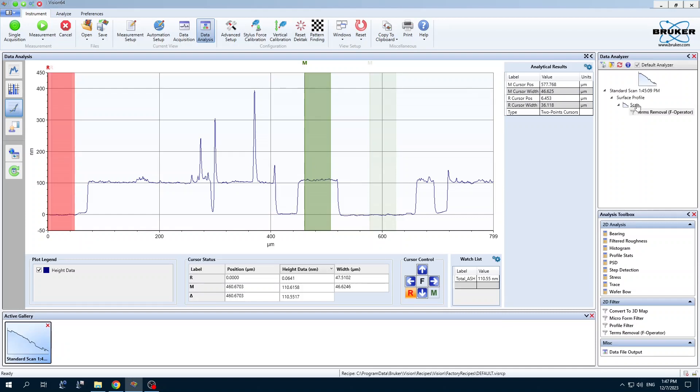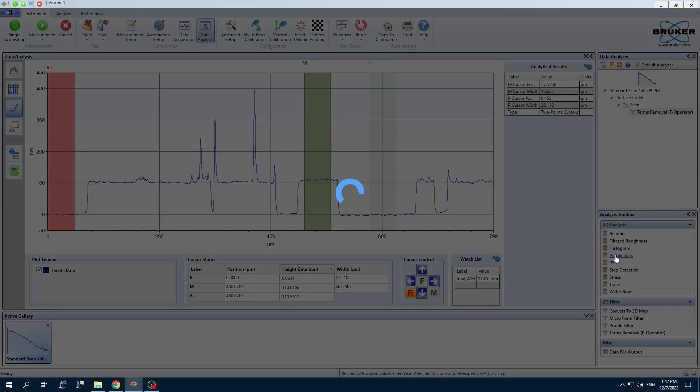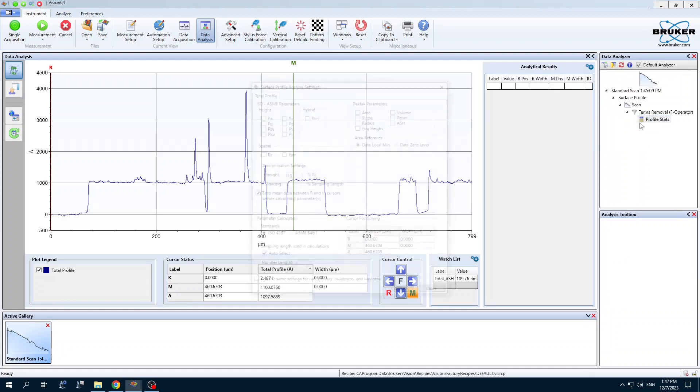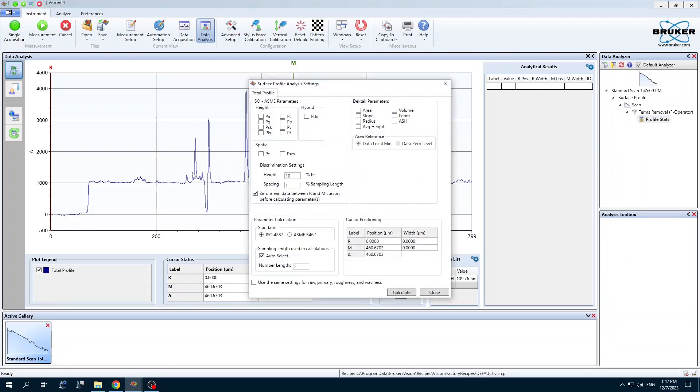There's other analysis you could do here. You could add something. Let's see. Profile stats. Edit settings. And you can choose from these roughness parameters here and calculate those.